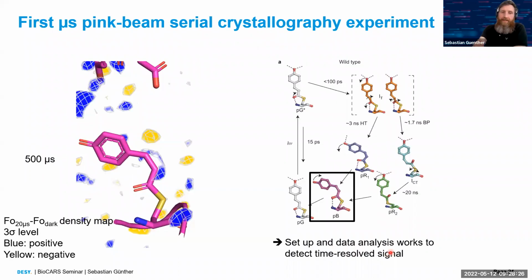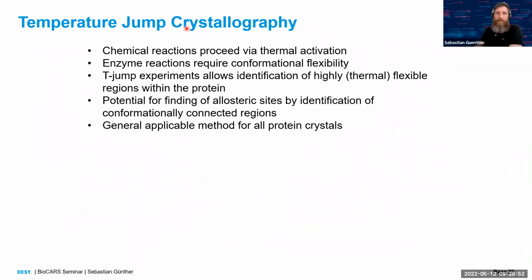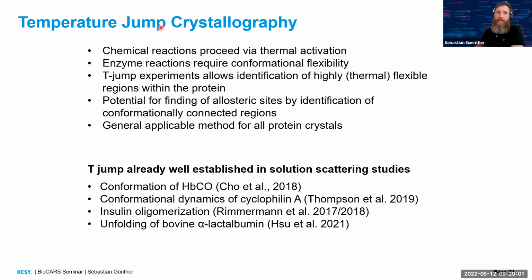These light-activated states, of course, only work for photoactive proteins, and only a very small subset of proteins is actually photoactive. So if you want to look at protein dynamics and excite your crystals by laser light, you need to look for some other means to activate them. Temperature jump studies have already been done quite a lot for solution scattering, but here we wanted to try this also for crystallography. The idea is that if we excite the sample and then follow the conformational changes in the structure, we might decipher how an enzyme reaction could occur once the protein is enriched in thermal activation energy. And this should be generally applicable to all protein crystals.